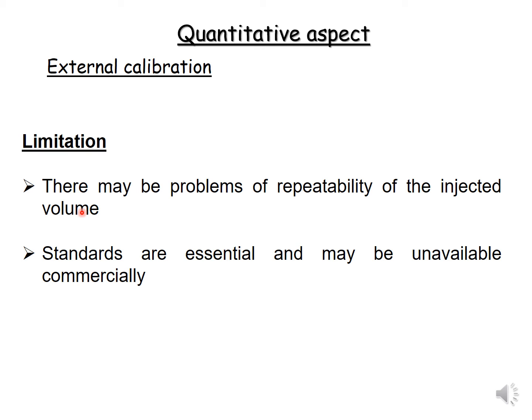Indeed, the area is proportional to the quantity of matter, but the concentration is not the quantity of matter. The quantity of matter is the mole number, and is equal to the concentration times the volume. If the injected volume is not constant, there is no repeatability, and then this is not proportional.